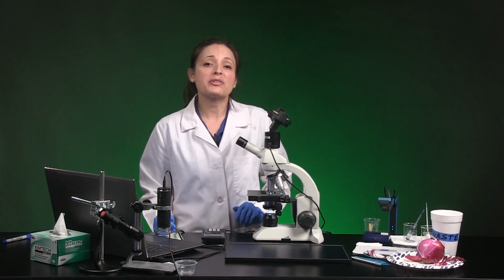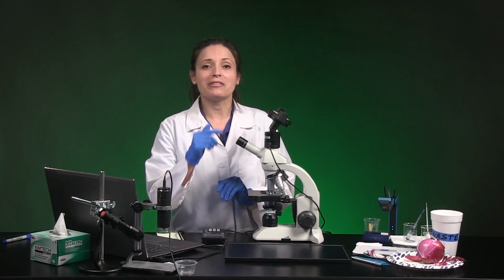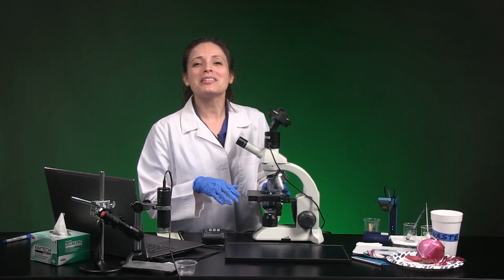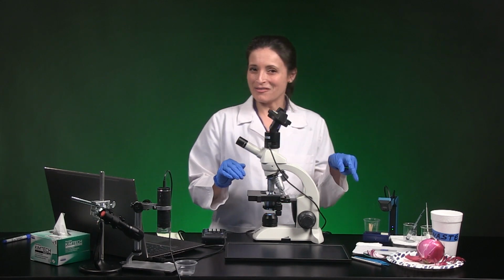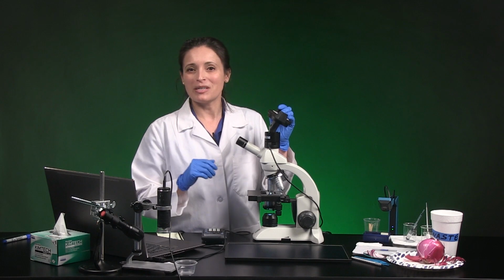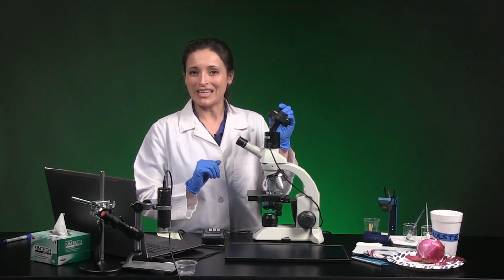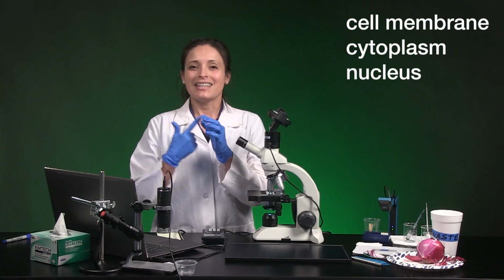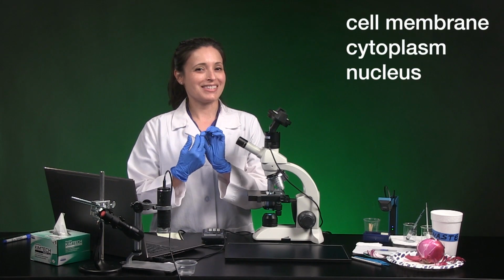And now you have to figure out screen magnification on your end and make a note of it for the 40x objective. Now back to the animal cells. Pause the video each time I get a section of the slide in focus so you can take time to examine many different cells and identify as many cell structures as possible. Look for the cell membrane, cytoplasm, and nucleus.